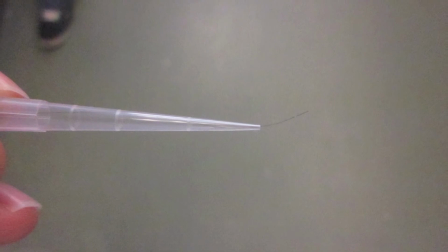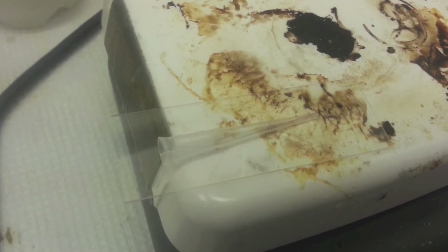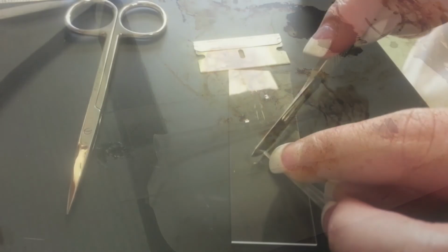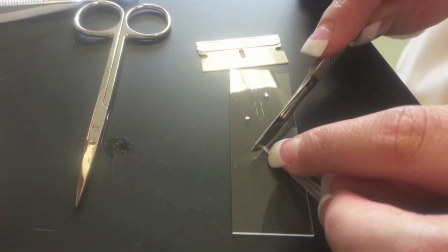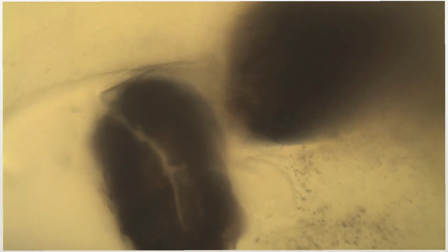For cross-sectioning by embedding the sample, the analyst first fills a pipette tip with the hair sample. The analyst then melts the tip of the pipette on a hot plate so that the tip of the pipette is flat, thus embedding the sample. Then the analyst will cut a very thin cross-section of the hair by placing a scalpel or razor perpendicular to the sample and cutting. The cross-section is then mounted and observed under the compound microscope.